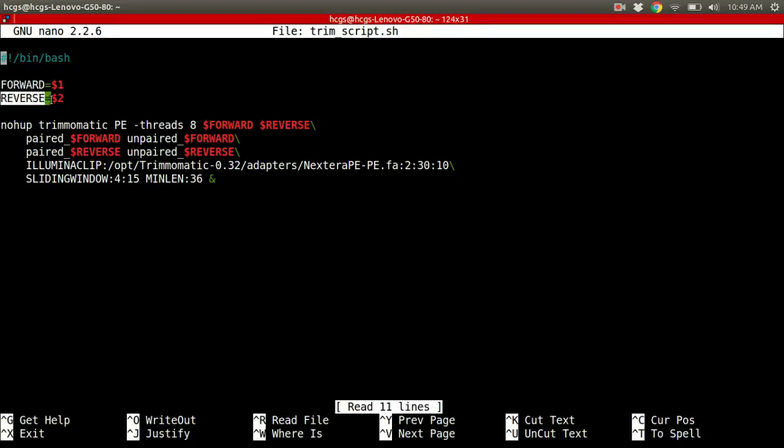Okay, now we have this. This is actually one command, believe it or not. What I've done is I've actually broken up this command into several lines because it's easier to see that way. And to do this, I've used this backslash right here. What the backslash will do is it will just tell the server that the command you're running is broken up into several lines. So you can delimit these lines with this backslash, and it will just combine them all in the end. But keep in mind that you can't have a space after this. You should have a new line directly after your backslash, because otherwise it's going to treat it as the next line and it gets confused. So make sure you have a new line directly after your backslash to have it all nice and pretty like this.